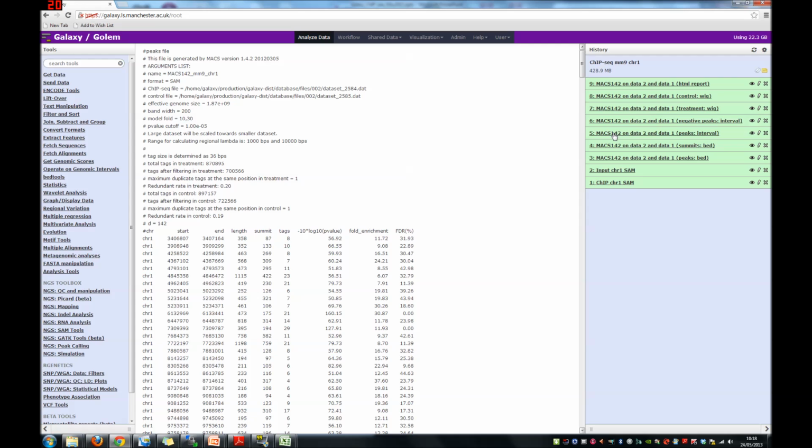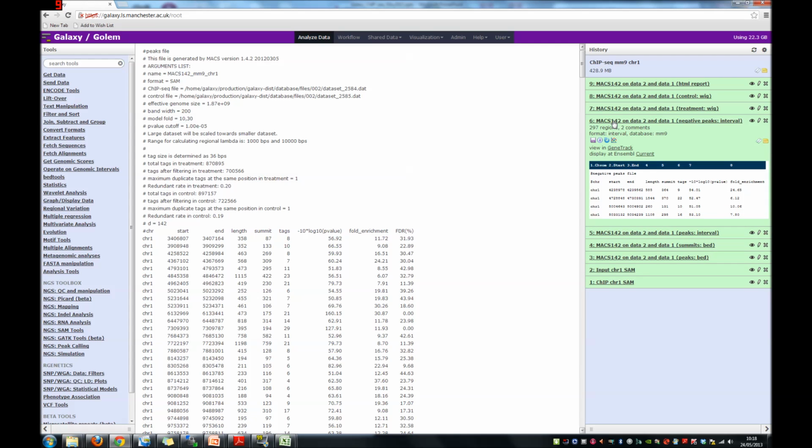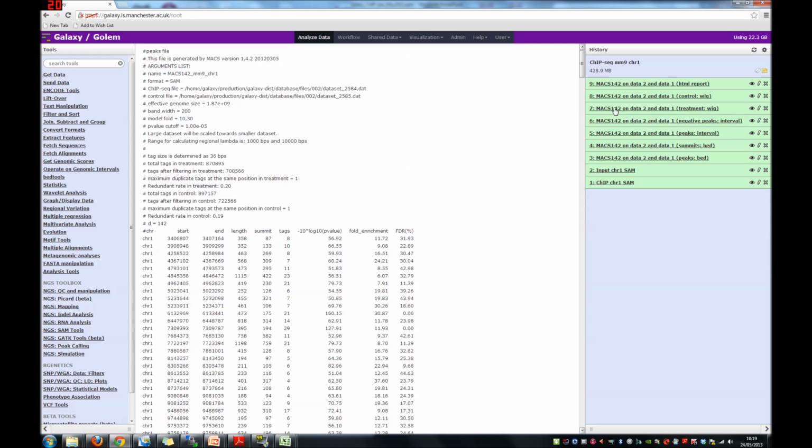Okay, we have the peaks that come from the sample swap, whereby the input is swapped with the chip. These two files are the wiggle files of the fragment coverage, non-redundant fragment coverage over the genome. We can use that in downstream analysis.